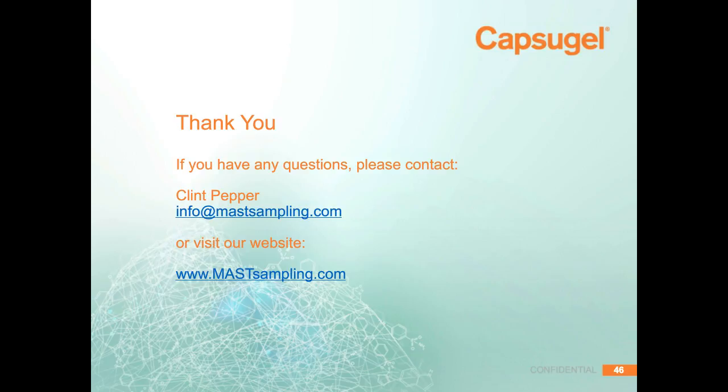Okay, great. Next question: how much IPA is needed for cleaning, and how is the used IPA disposed of post-cleaning? So it depends on your particular process. We generally consume per sample about 100 milliliters of IPA, maybe it's like 80 milliliters. It depends on how much you want to flush through, how long your lines are, and some other components.